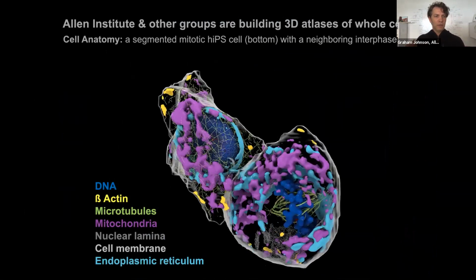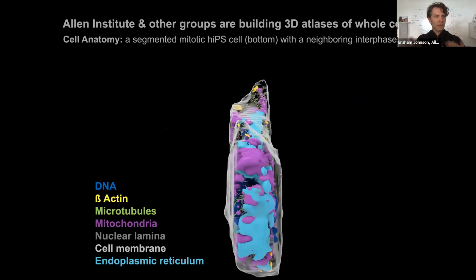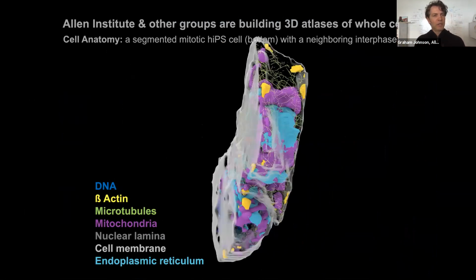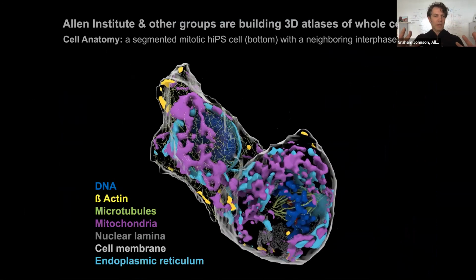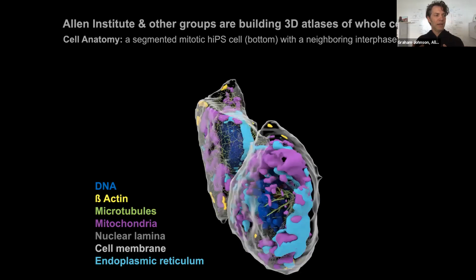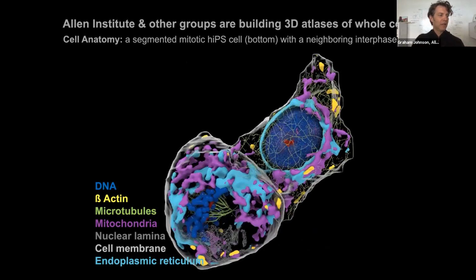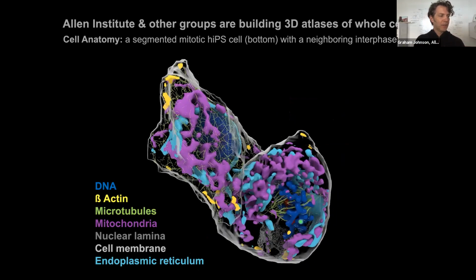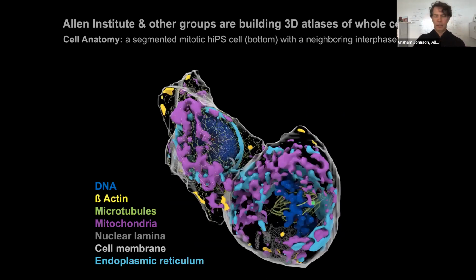And a second ago, you saw some of our raw data spinning around, collected directly from the microscopes with a field of cells butted up against one another. And here I'm showing a rotation of 2 cells that have been segmented, where their structures have been outlined from that data. And we can see one mitotic cell next to one interphase cell with recognizable mitotic structures of the chromosomes being pulled apart by the spindles in the lower right here.